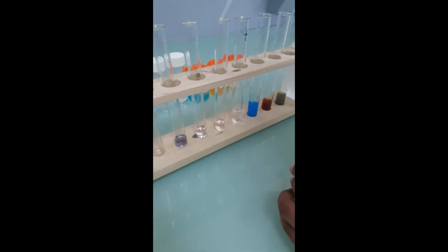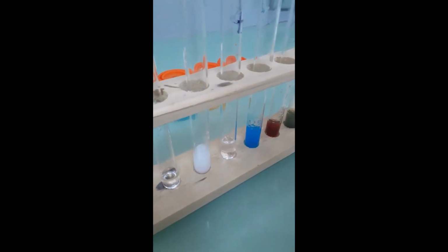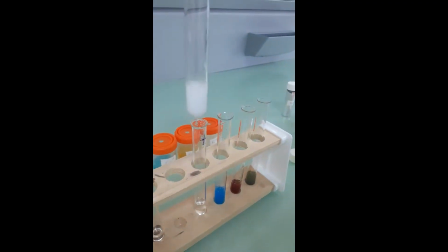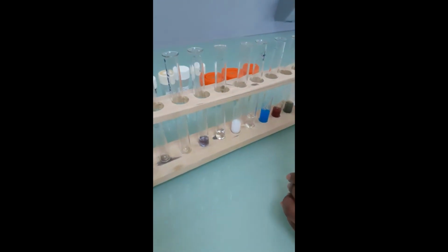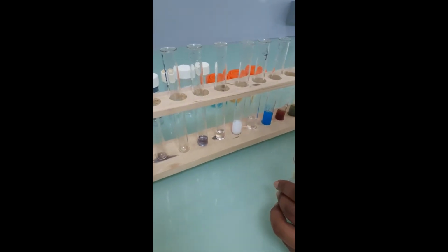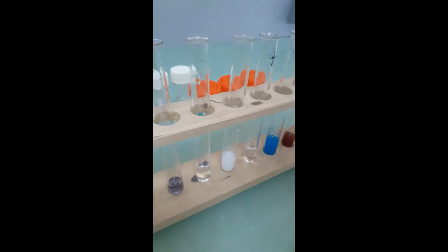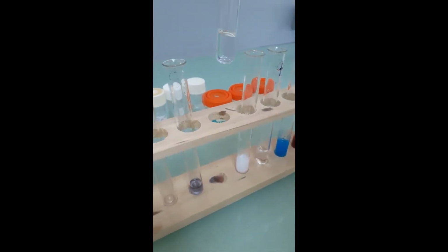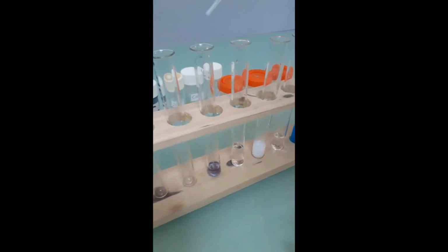Ca2+. Zn2+. Excellent. And then we have Cr, the Cr3+.